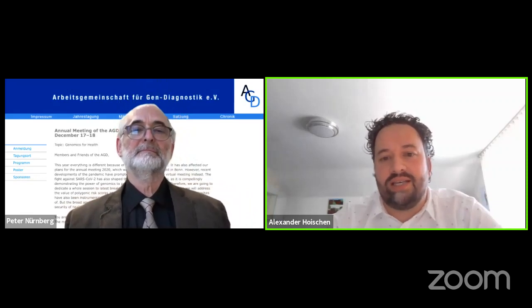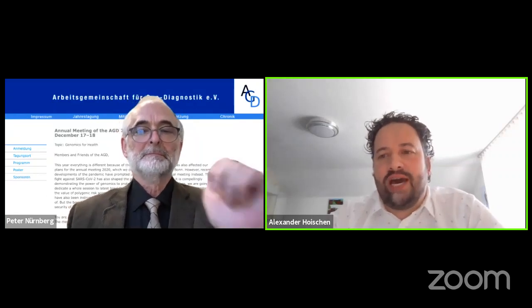So first question, how much conventional karyotyping are you still doing at Radboud CMU? I don't know the exact numbers, but I think for leukemia alone, it's more than 2,000 karyotypes still. And there's still several done for infertility, recurrent abortions, some occasionally prenatally. So I think altogether it's more than 3,000 karyotypes a year. Okay. And you foresee a longer period of transition. It will not be stopped very soon. I mean, not immediately. I think for now, but that's very personal to our laboratory.